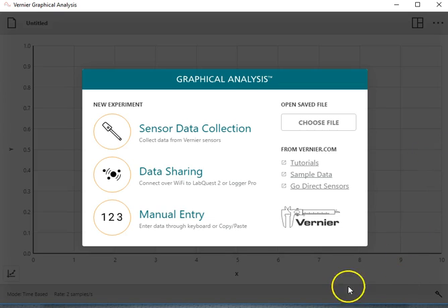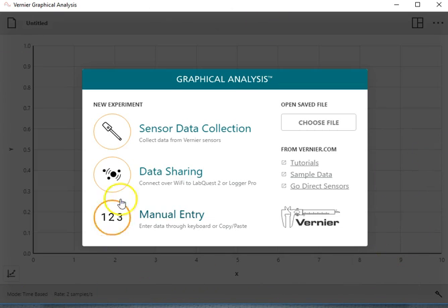I want to go back to the screen you see when you open up the application. The screen we'll be using is this one — sensor data collection. Since I don't have anything connected right now, if I were to click on it, it would give me a message that no sensor was detected.